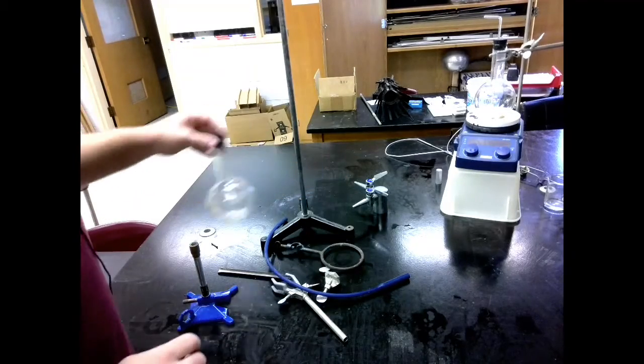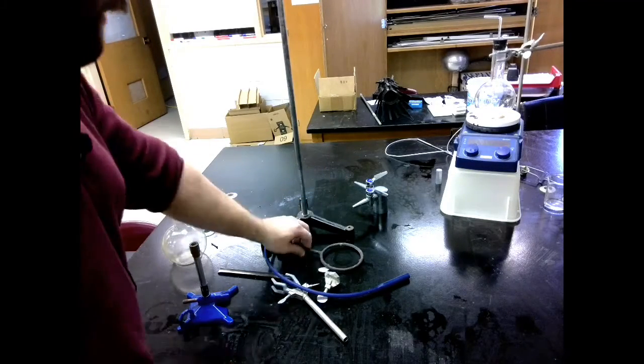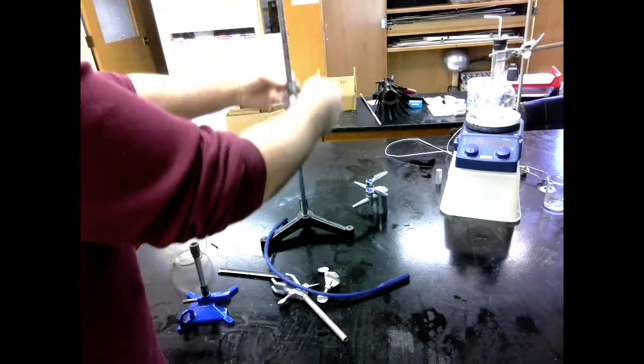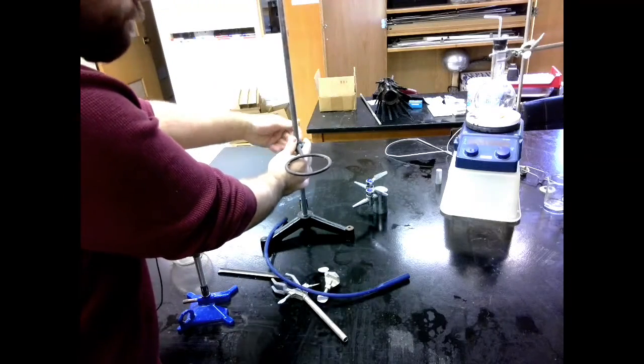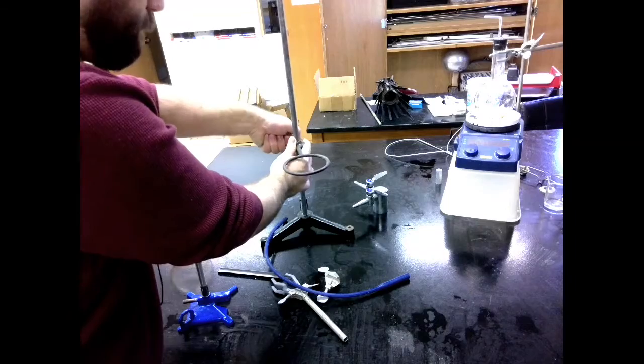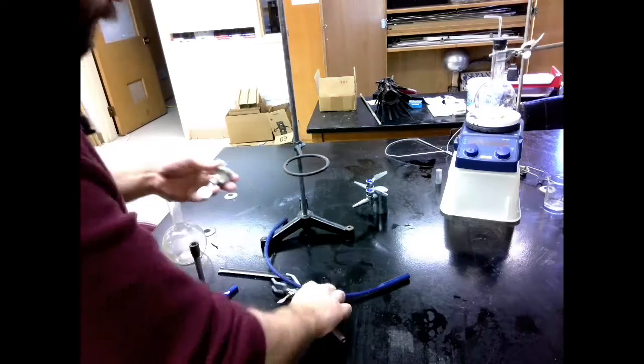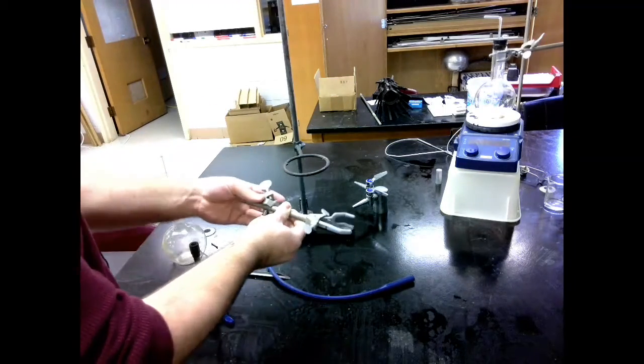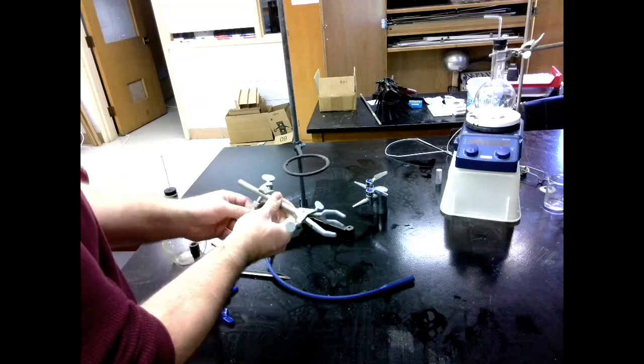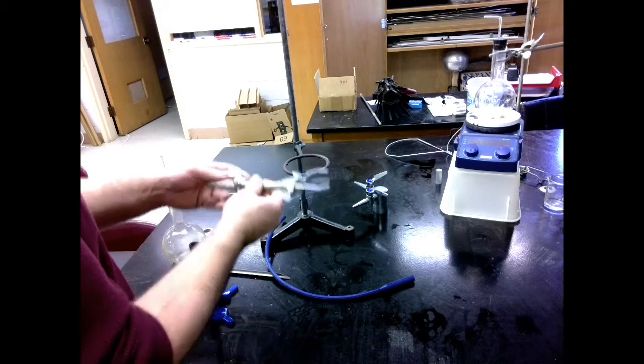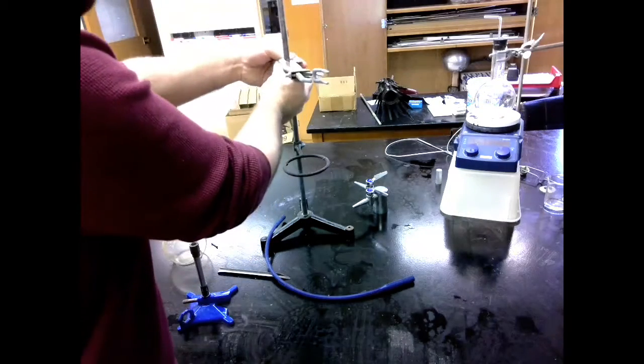First thing I'm going to do is set my ring on my ring stand. Tighten it up, and we'll just set it at a relative height for now. I'm going to set up my clamp here, and I'm just getting it started.